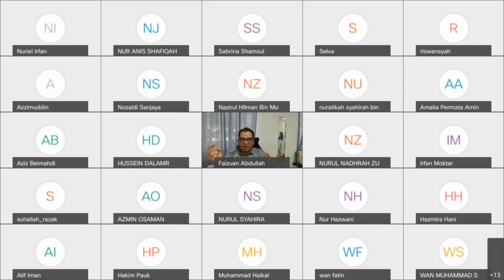Okay. So we have the light source. Either our sample or our analyte absorbs the light, and we have a detector. The detector will detect how much of the light is being absorbed. So it will represent the concentration. Qualitatively, it will represent what type of sample, represented by the bandwidth, at which part of the wavelength it is being absorbed. So it is qualitative. And then the quantitative part is how much is being absorbed.